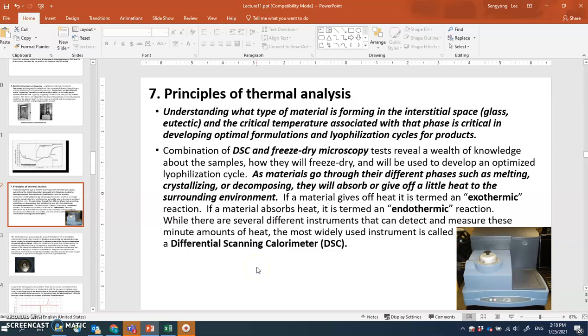Okay, so this machine will allow it to find out exothermic transition, endothermic transition reaction. So exothermic, maybe it gives up the heat to outside. Maybe it's from crystal to liquid transition, or liquid to vapor transition, or maybe it's the other way around. Okay, endothermic is it's absorbing heat energy.